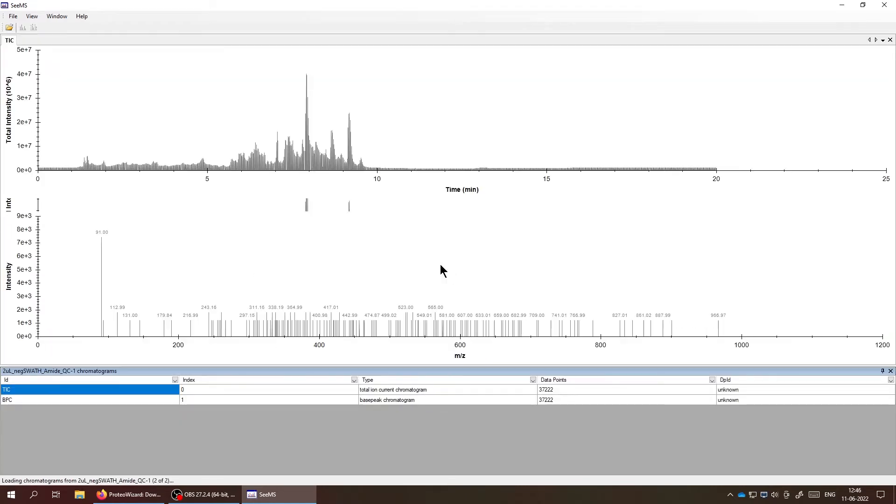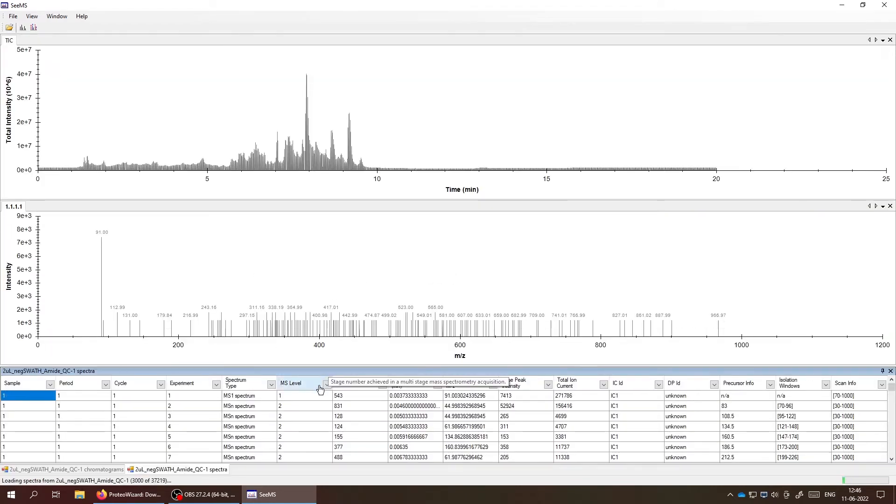So after you select the file and open it, it's going to load that and take some time to show up. You can see there are certain columns here with which you can filter the data as well and visualize.